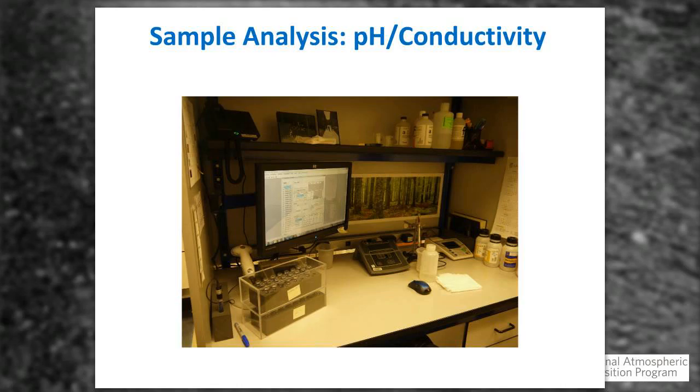The data go real time into our central database, where it's verified, and we run control charts. Those of you that have been in the program a real long time, before 2004, you might recall you also ran chemistry at the field site, pH and conductivity. Airmont stations still do that, of course.